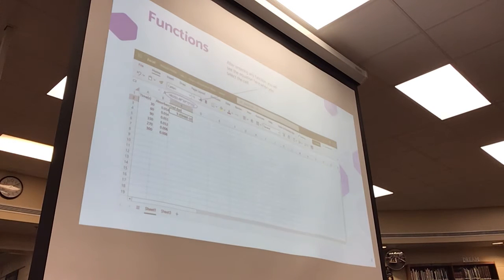Okay, so whenever you enter any function, whenever you hover over that cell, you'll be able to see the function in the way that you typed it in. So basically, anytime you use a cell, that cell's name will be in this function row. Any questions about that?